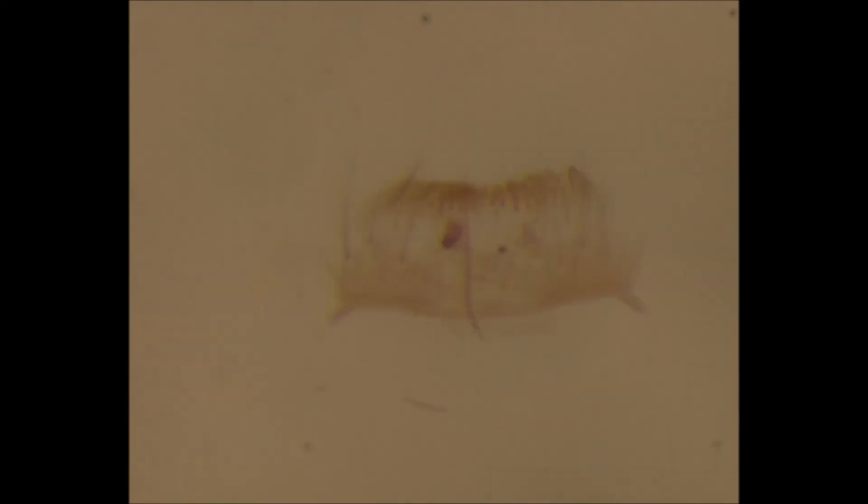I'll try to position that so that the ventral surface is up. Let me zoom back in. You can see this is the ventral surface because here's one of the rods on either side of the sensory cup. There should be two; I'm not sure if one got torn in the dissection or not, but I'll have a look at that under the compound scope.